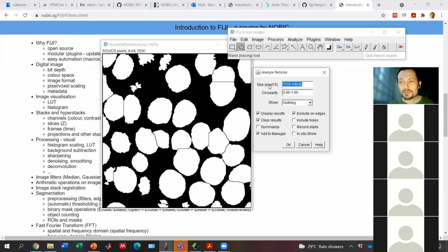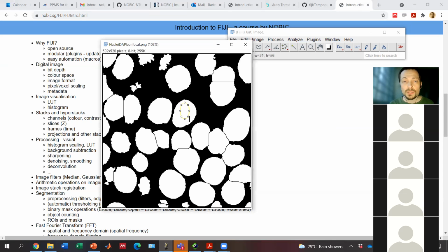There is sort of the convolution procedures. And in this case, if you want to see how large your objects are, you can, for example, draw a region of interest. So I draw a region of interest. This is 50. So the diameter of this circle is 50.